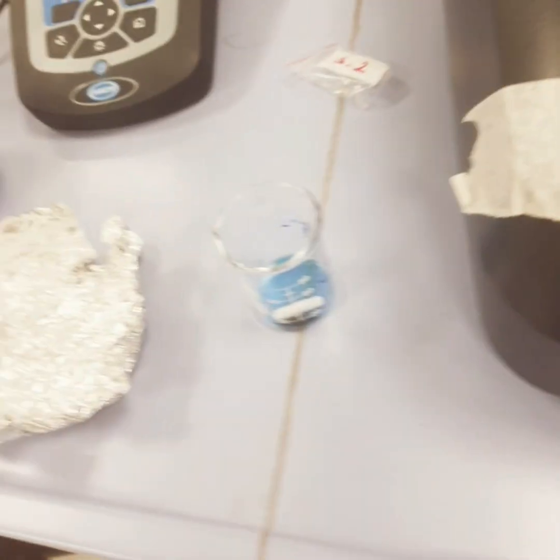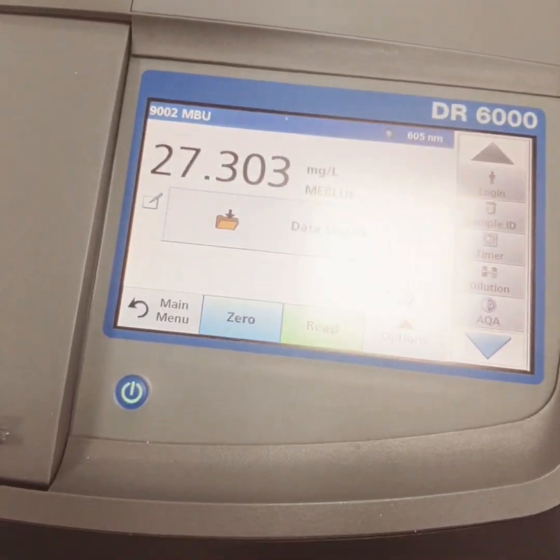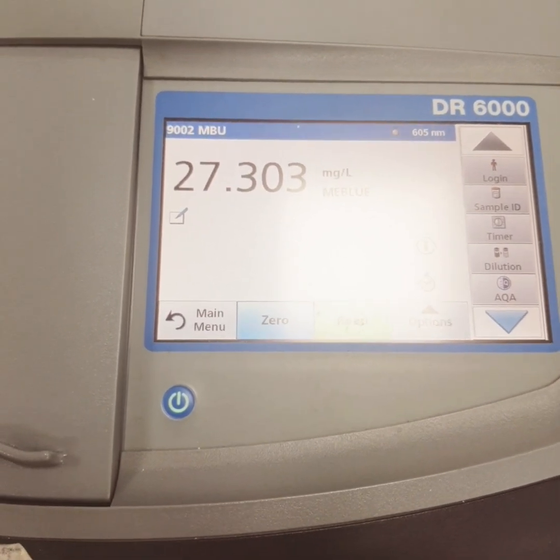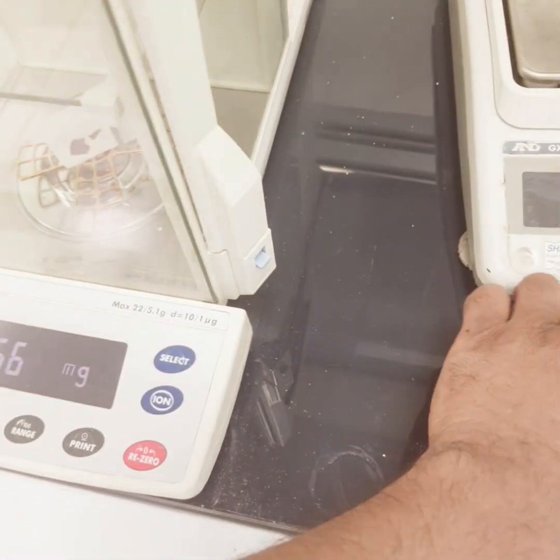Now after two hours we are going to measure the methylene blue concentration. So the concentration here is around 27, initially it was 28. Now we are adding the same amount of the membrane and we would put also the concentration of the dye similar and then we would add another scavenger.